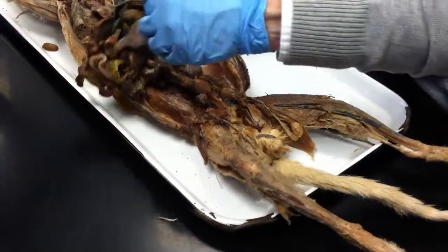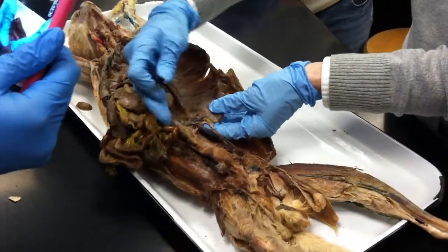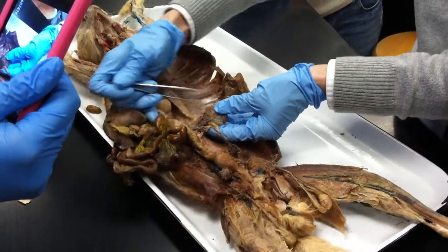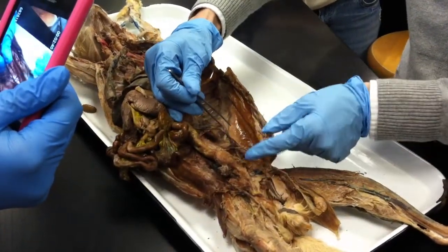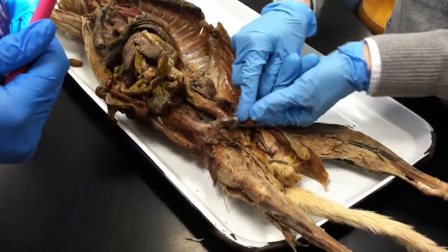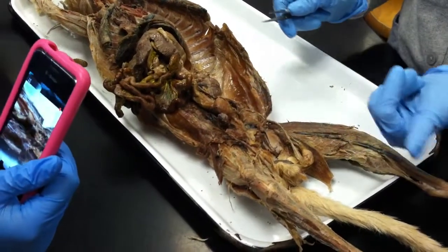Do we have a kidney in here? Yeah. The kidneys over here. That's your kidney. Okay, and you can actually see renal veins and arteries on this guy. Right there. Okay. And then coming down is the ureter, all the way down here. And the ureters join in down here to the bladder. Okay, and then again the urethra out of the body.